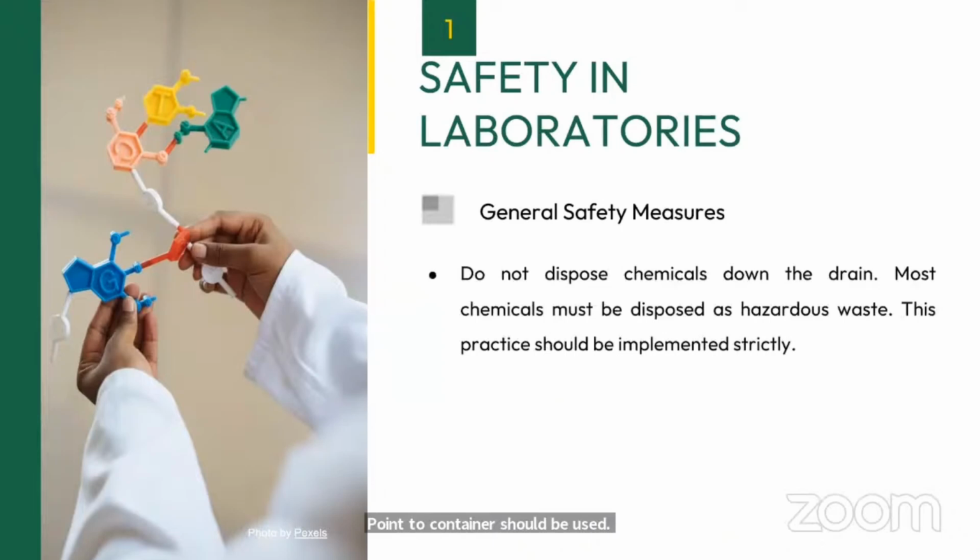Do not dispose of chemicals down the drain. Do not release chemicals or other liquids from your laboratory directly into the public drain. Most chemicals must be disposed of as hazardous waste, as per the guidelines and regulations for hazardous waste. This practice should be implemented very strictly.